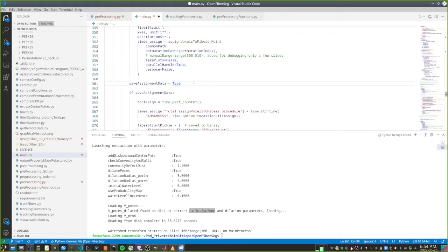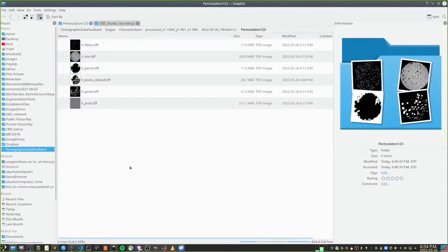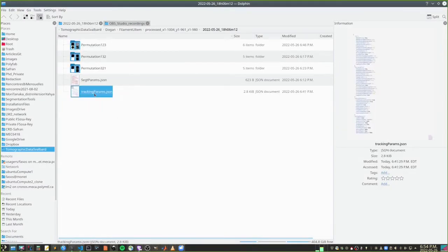I've tested this on like 40 different data sets, and I think I worked out most of the bugs. It shouldn't crash. There might be a reason, like the extraction is not optimal. You may need to play with the parameters a bit, but the default parameters work fairly well for most situations.